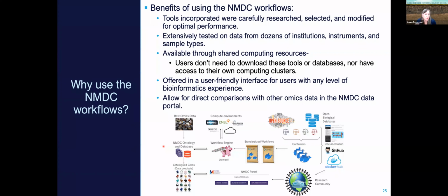So why would you want to use the NMDC workflows? Well, these are tried and true bioinformatics tools, and they've been carefully researched. They've been tested at many, many different institutions from different sequencers and sample types. We have these available to you through shared computing resources so that you don't have to download the tools or all the databases that go with these tools. And you don't have to have access to your own computing clusters.